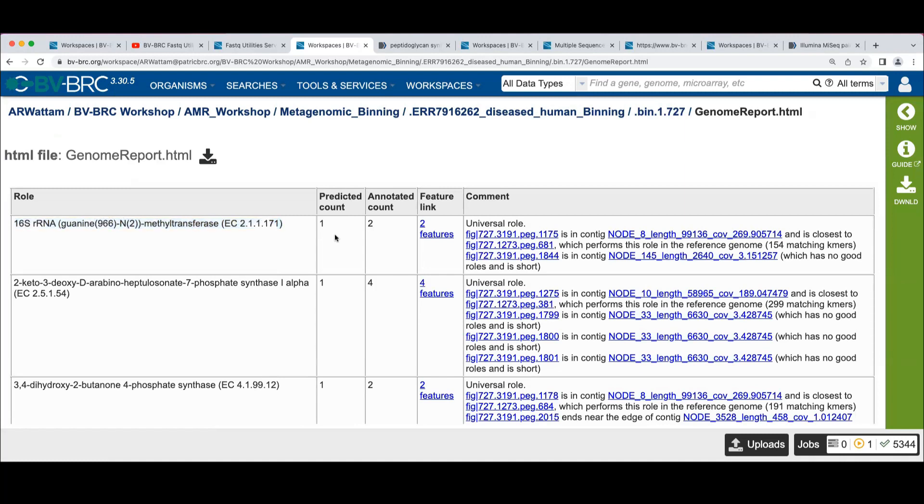So what this is showing us here is that this mouthful of a function, the predictor said, based on the functional role content of the rest of the genome, that we should have had one of these, but we actually had two.